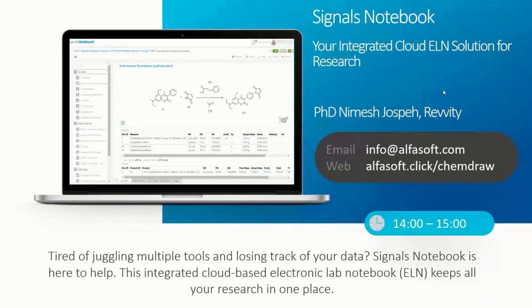For Signals Notebook Standard Edition, there are currently roughly 10 updates per year. That is around one update every 6 weeks. Smaller updates will be readily available automatically to the users. Bigger updates addressing new features may require an activation and configuration process performed by the system administrator in your organization.